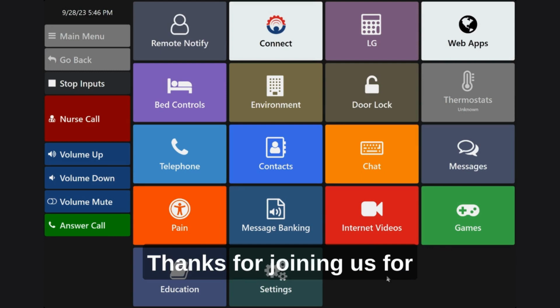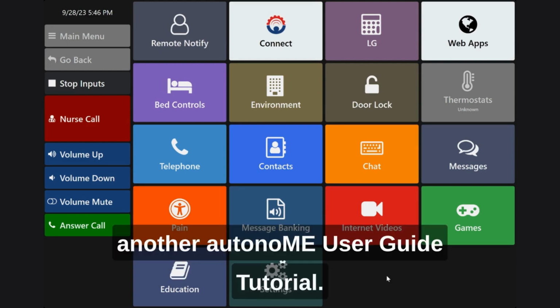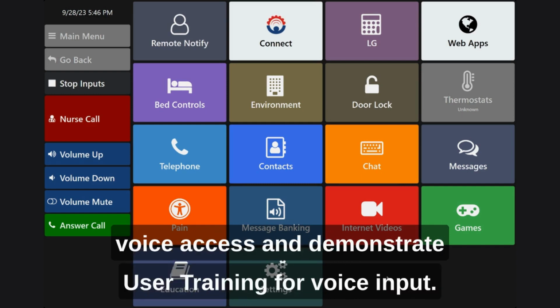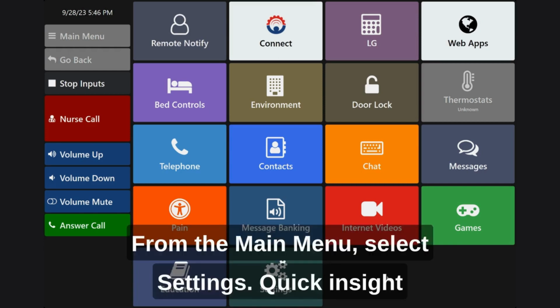Hi there. Thanks for joining us for another autonoME user guide tutorial. In this video, we will prep our autonoME for voice access and demonstrate user training for voice input. Let's get started. From the main menu, select Settings.